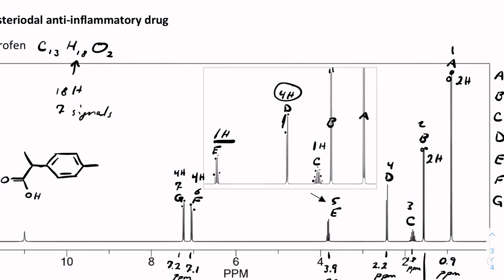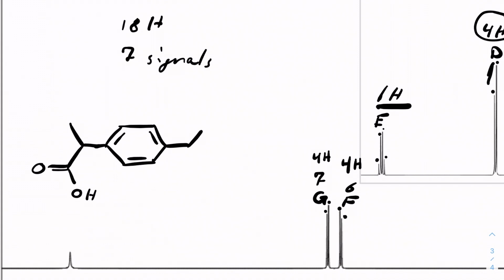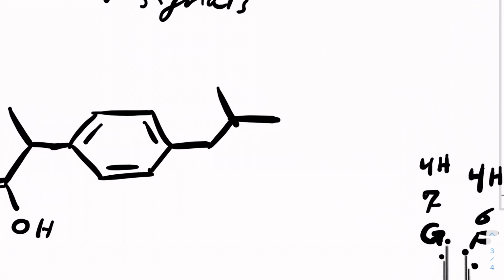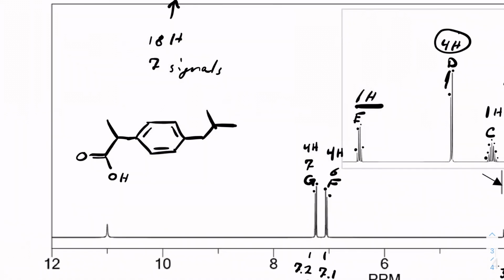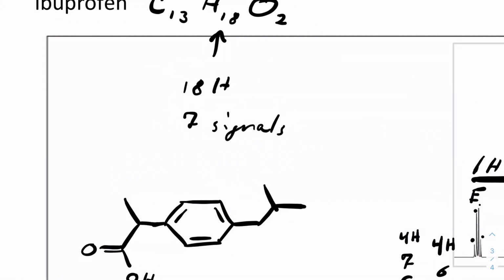And so we can go ahead and move on to this other side. We know that there's going to be some more CH3 groups coming off of here and some CH2 groups. And so we've got, it looks like, just a carbon chain with a methyl group coming off. And again, we know that through our proton NMR and through our carbon NMR more specifically. But what we can now check is if we have 13 carbons, 18 hydrogens, and 2 oxygens.